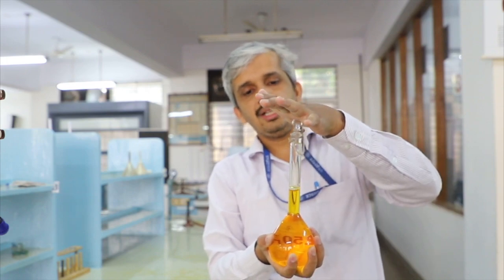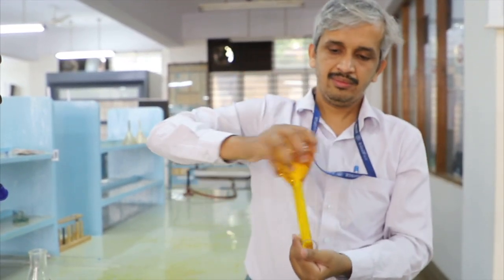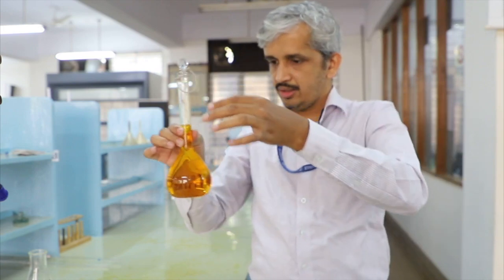It has to be done at least 4 to 5 times to get a clear homogeneous solution. So now we have a standard potassium dichromate solution ready here.